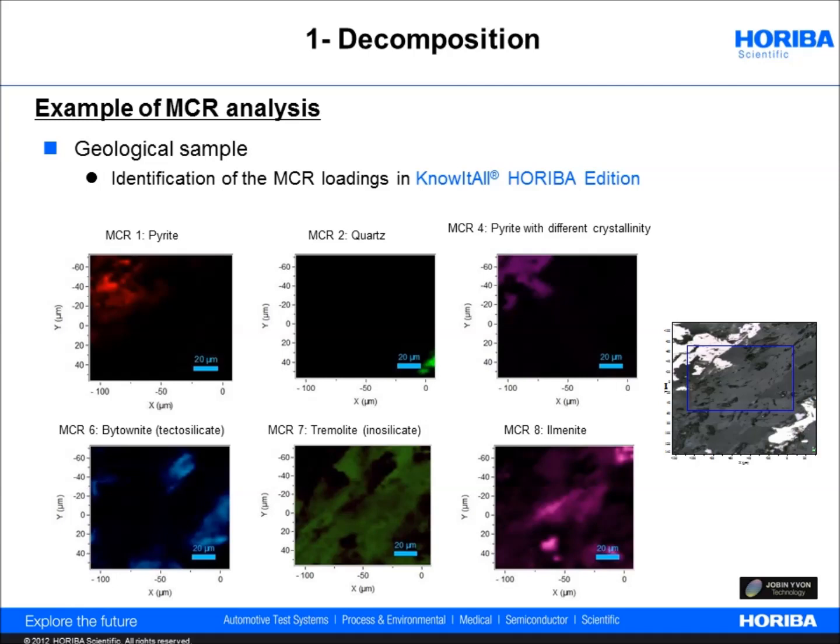With PCA, the loadings will be the same whatever the selected number of components. This is not true with MCR. This emphasizes the fact that the choice of the number of components is quite important. Using PCA and crossing the results with MCR might then be recommended to find out an estimation of the number of components to keep.